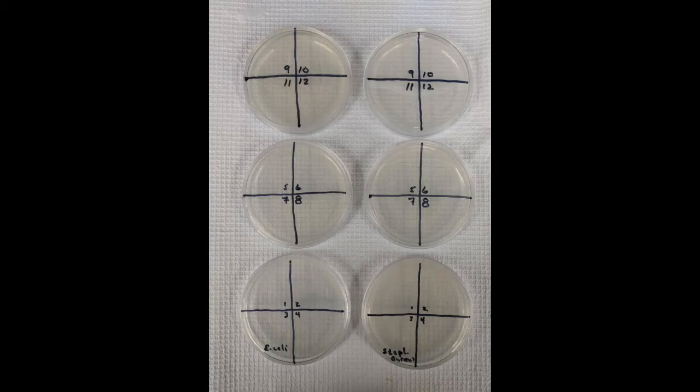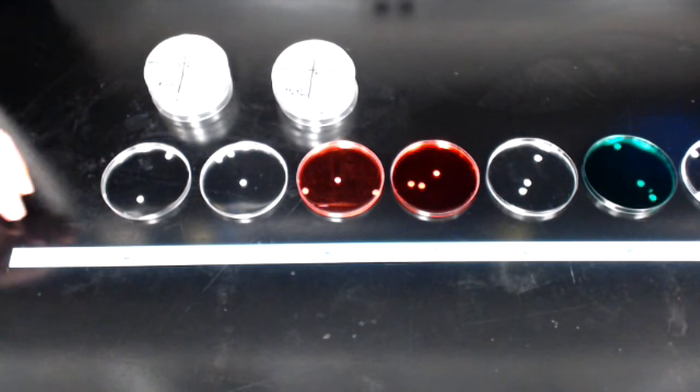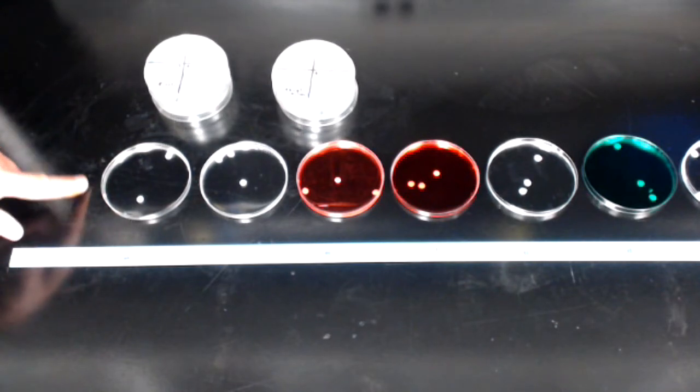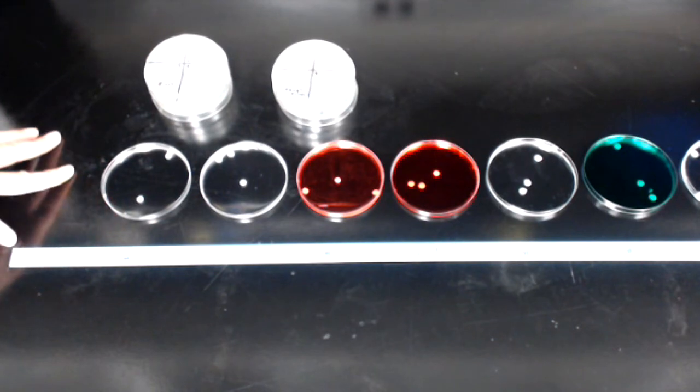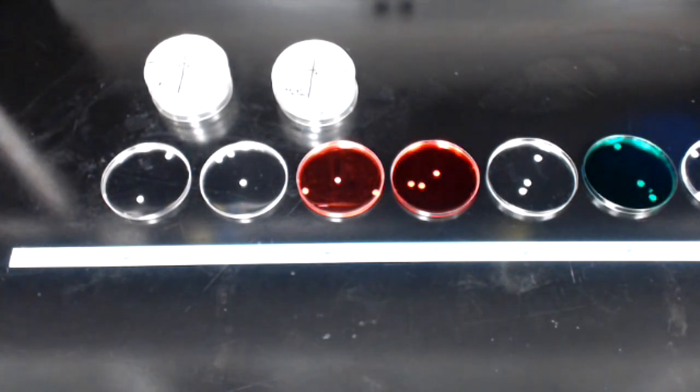This picture shows the 6 plates. The 3 plates on the left are E. coli plates. The 3 plates on the right are Staph aureus plates. Now, of course, each of those 12 numbers is associated with one of the 12 disinfectants and antiseptics. As I already mentioned, the number 1 plate here, the one farthest to the left, the one I'm pointing to, corresponds to the number 1 disinfectant antiseptic. The number 1 disinfectant antiseptic on your list in Module 15 is in fact 70% ethanol.